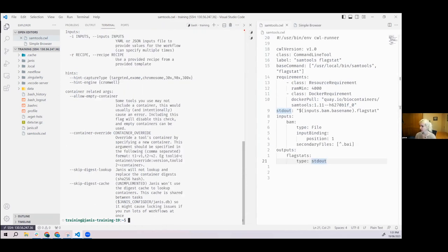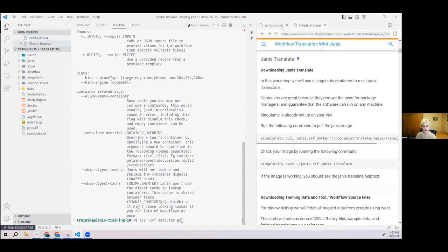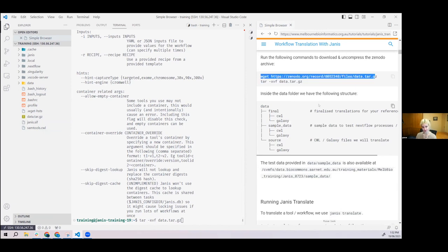Now we've got Janice and we can run it. We need the sample data — it's in the folder as data.tar.gz. We're going to extract the archive: run tar xvf data.tar.gz. That will inflate the archive and you'll see a structure with a data master folder, sample data with BAM files and genome annotations, a source directory containing the CWL and Galaxy files, and a final directory containing all the Nextflow translations we're going to build. The final folder is reference material — if you're ever confused, you can look at the final solution there.